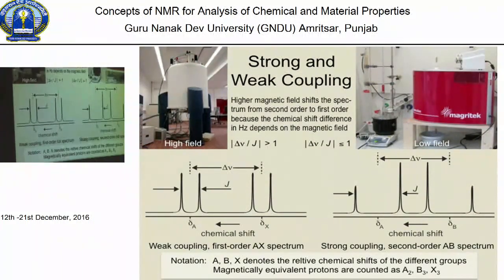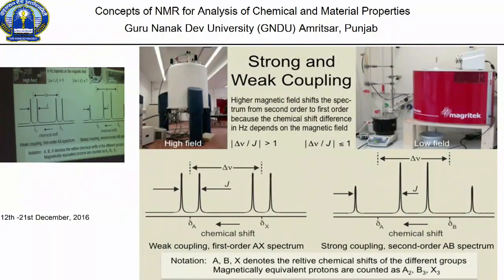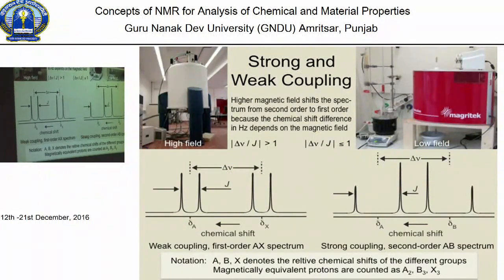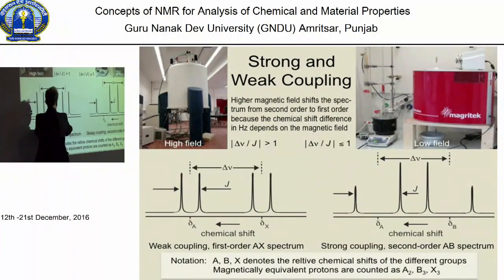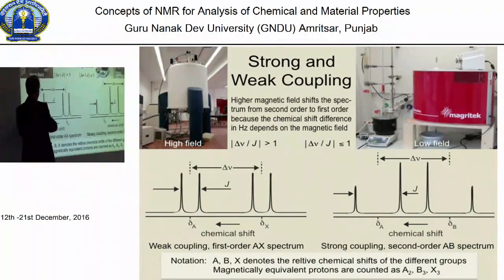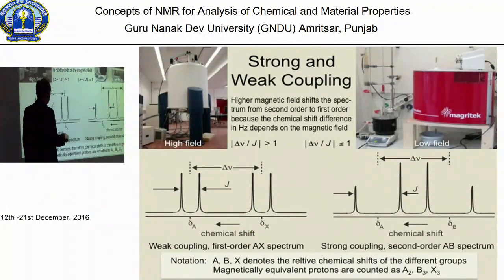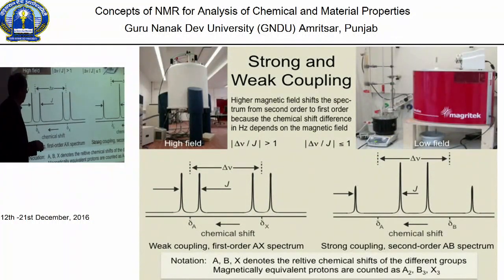Now when that approaches 1, something happens: first of all, the two doublets move closer together, and that means this is drawn on a different scale. The J coupling, that splitting, really corresponds to this splitting over here. I should change that in the text.